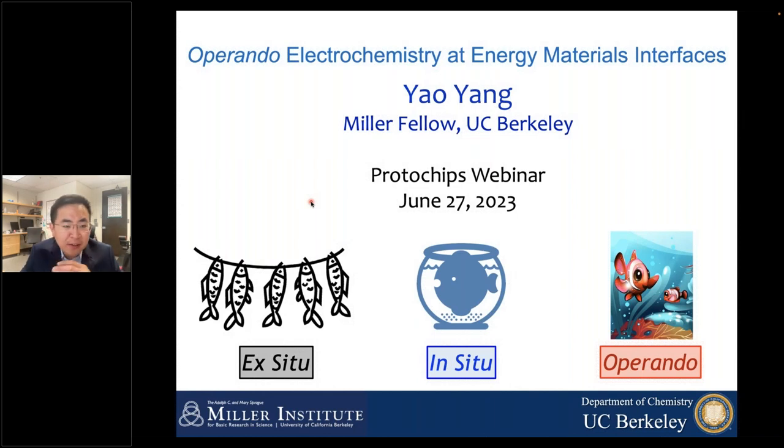So perhaps you have seen here a fishing analogy of the transition going from conventional ex situ methods to in situ methods to partially simulate reaction conditions, and eventually to operando, that is, to study energy materials under operating conditions.